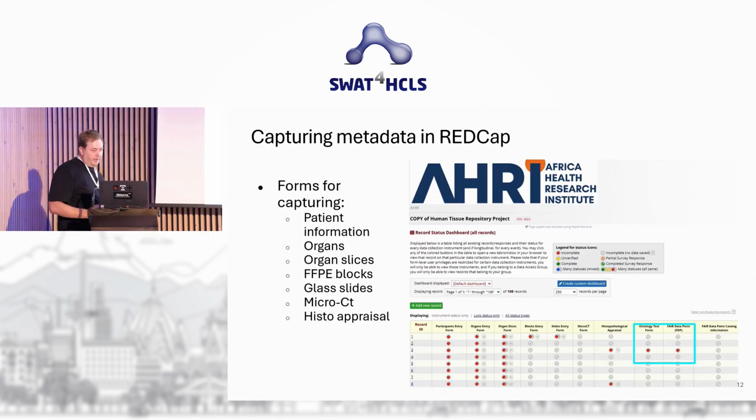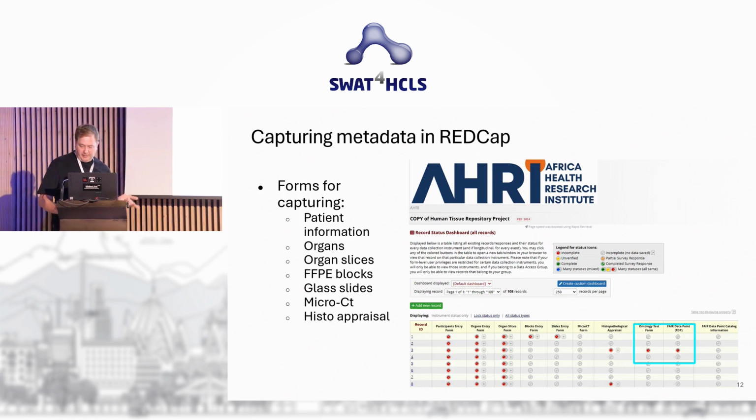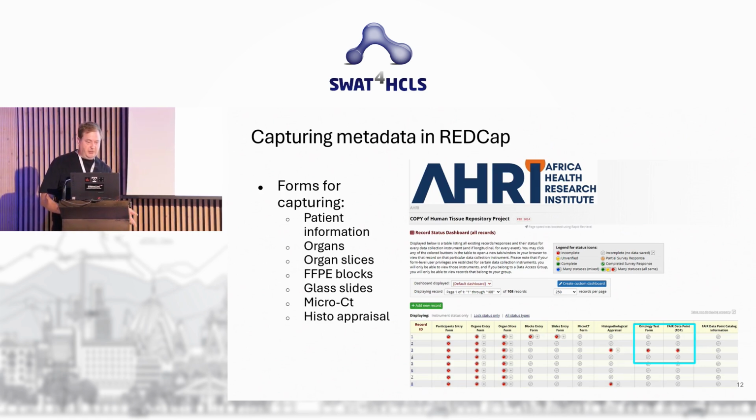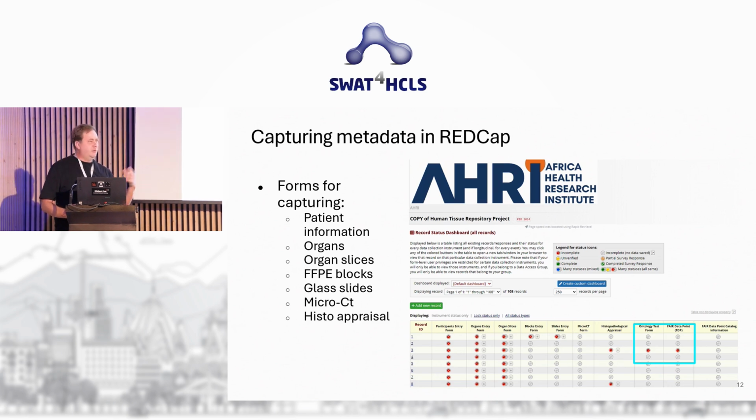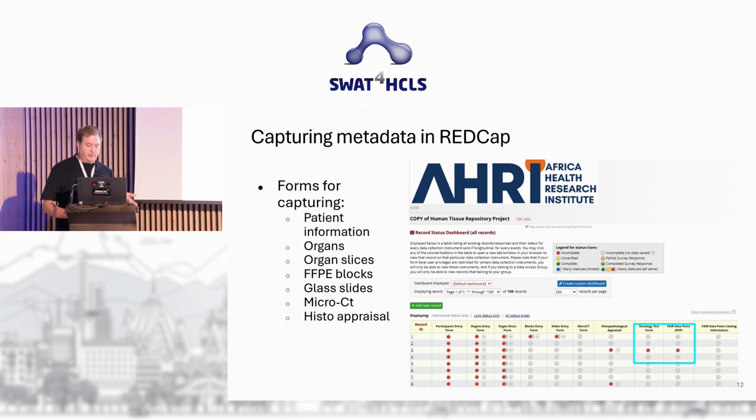And in REDCap, we have forms for capturing various different stages of the process, the patient information, organ information. Then as the organs are divided up, from each of those, the paraffin blocks, the glass slides, micro-CT, and histological appraisal, and so on. For those who aren't familiar with REDCap, I think it stands for Research Data Capture. It's a fairly mature system for designing forms for capturing this kind of information. You can build a lot of logic into it.